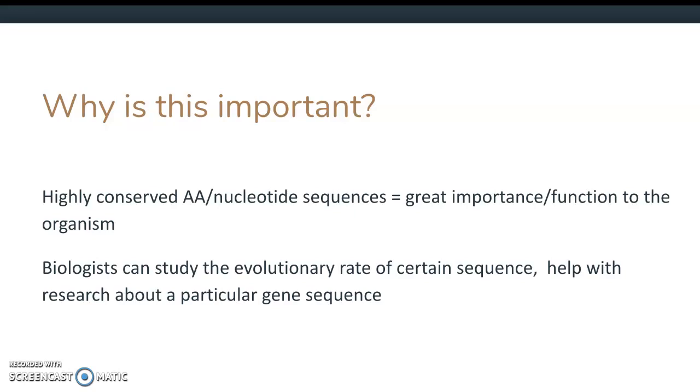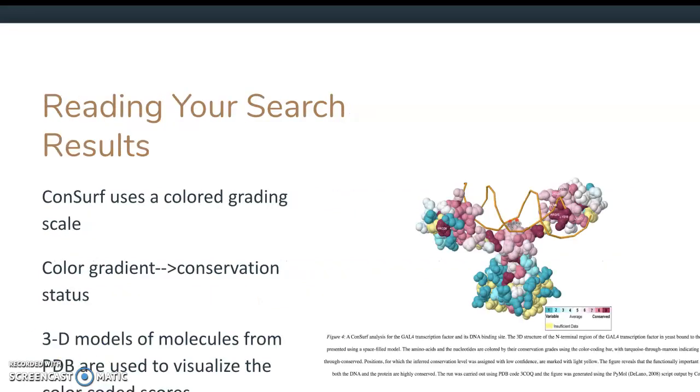To read your search results, let's look at the color grade. First off, the color grade for the molecules is read from left to right, with turquoise being the least conserved and magenta being the most conserved. Conserved just means the frequency of it. Any areas in yellow are considered uncertain by the mapping program and should be treated as outliers in your data sets.